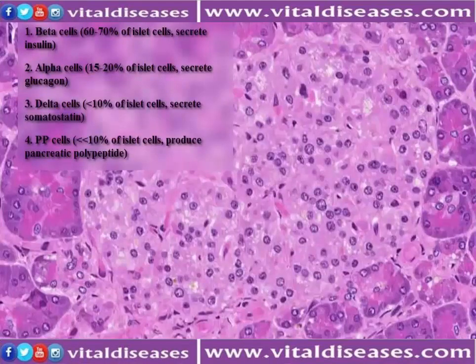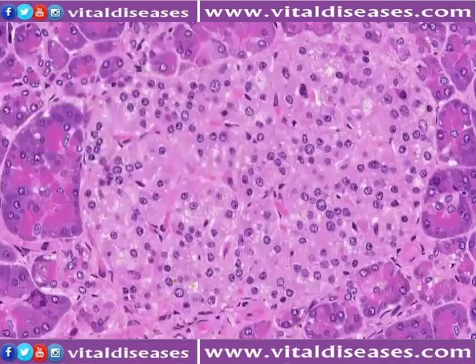Each is present in varying concentrations and with distinct functionality, but it is not possible to discern the differences between the cells at this level of microscopic staining. Beta cells tend to be located centrally in the islets and may have larger nuclei. PP cells are very rare and make up the majority of diffuse islet cells.